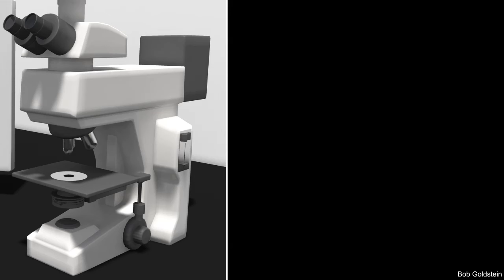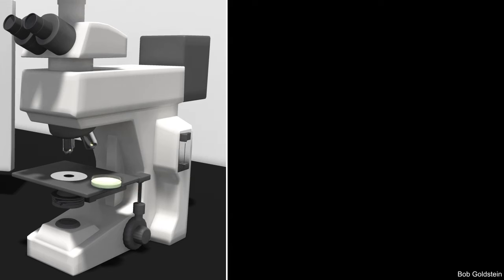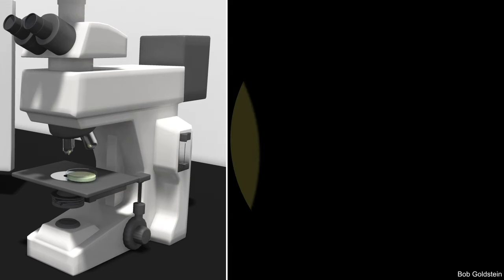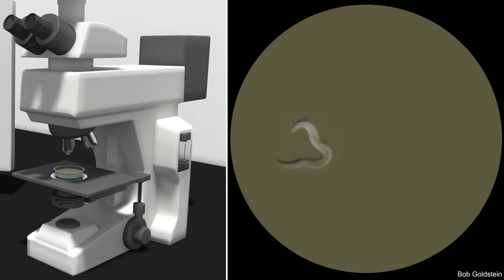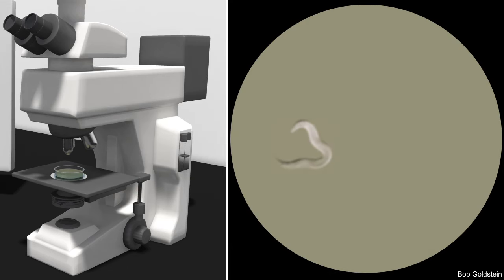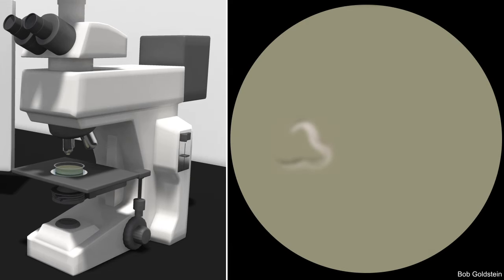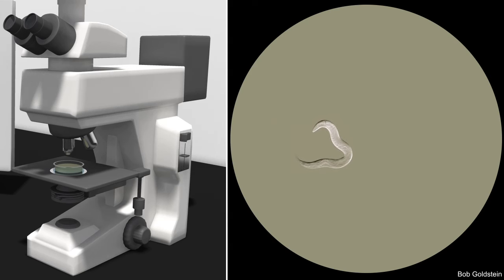To view a sample under the microscope, the researcher first places the object on the stage and then manipulates the controls — including the light, focus, stage position, and objectives — while viewing the sample through the eyepiece until a clear image is obtained.